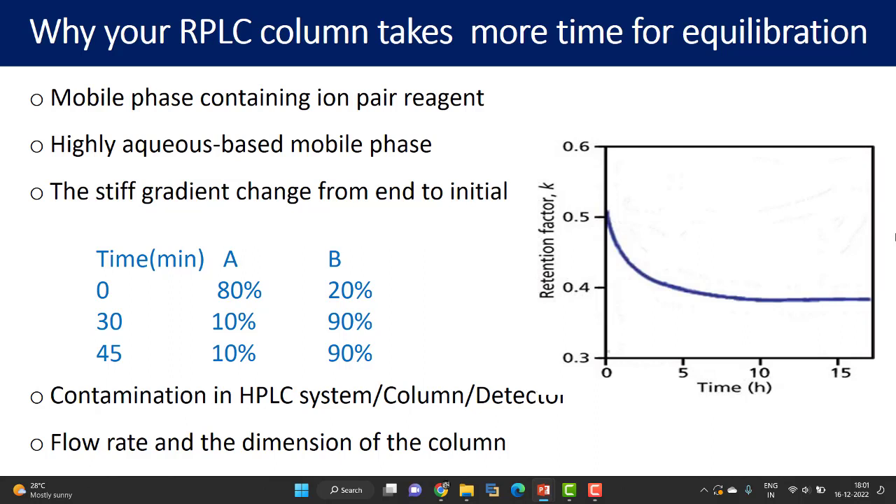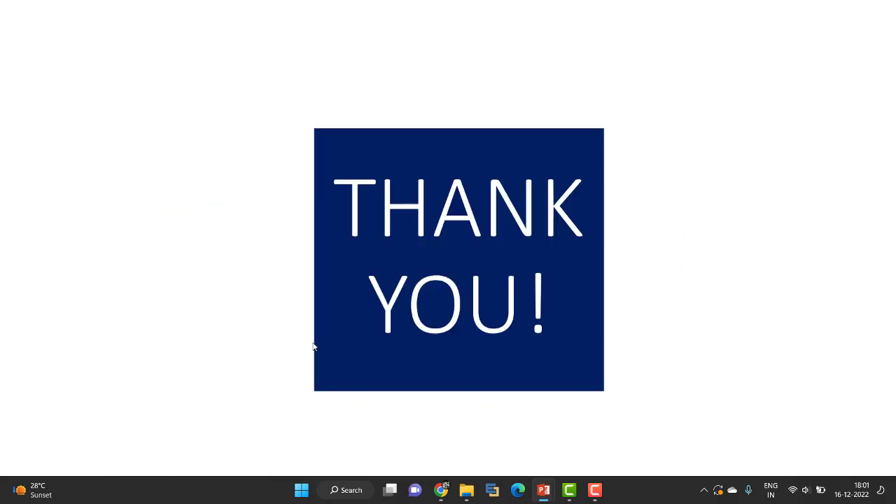To summarize, the reasons for higher equilibration time in reverse phase liquid chromatography are: mobile phase containing ion pair reagent, highly aqueous based mobile phase, steep gradient change from end to initial conditions, contamination in the HPLC system (column or detector), and flow rate and column dimensions. Thank you so much and keep learning.